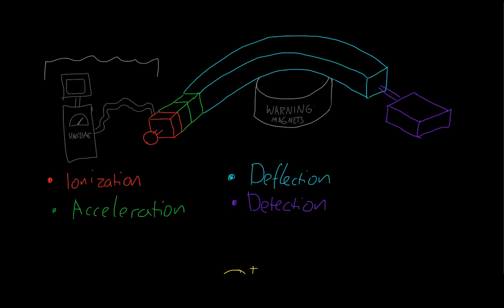Back in our mass spectrometer, we can have a sample that's ionized, accelerated. Let's just make multiple molecules in this sample. Can be accelerated along, down the chamber. At this point, it's still just a single line with our multiple different ions in it, and then the strength of the magnet splits the ions based on their mass.